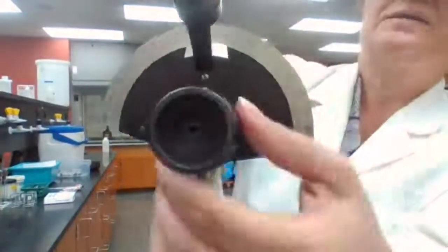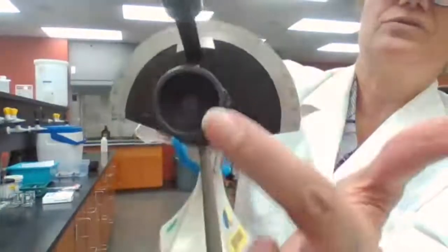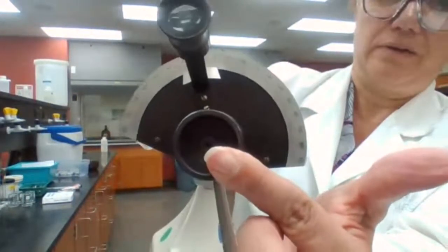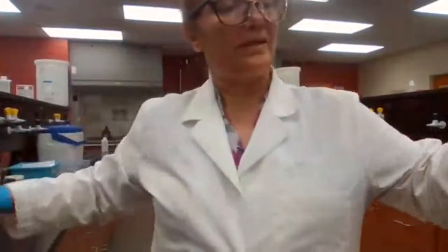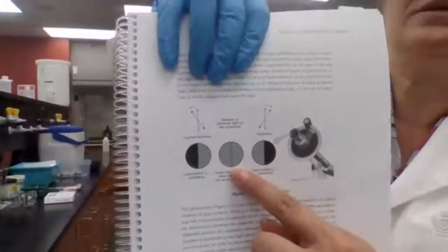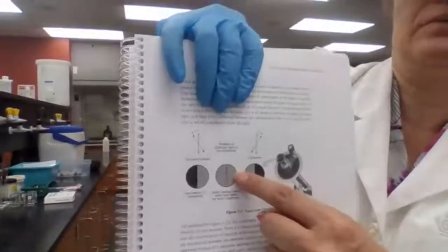When I'm looking at this, it should be exactly at 0, 0, okay? When it's exactly at 0, 0, I look through the eyepiece. If my compound is not chiral, if it's achiral, I'm going to see something like this shape here, which has the same shade of gray color on both half circles.